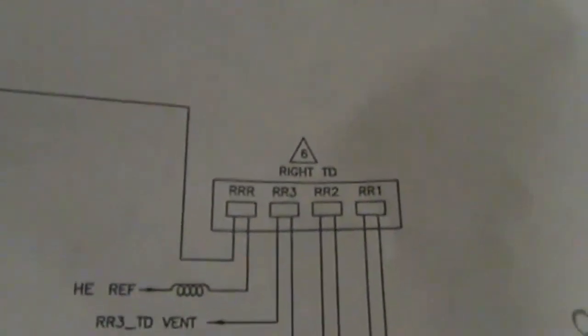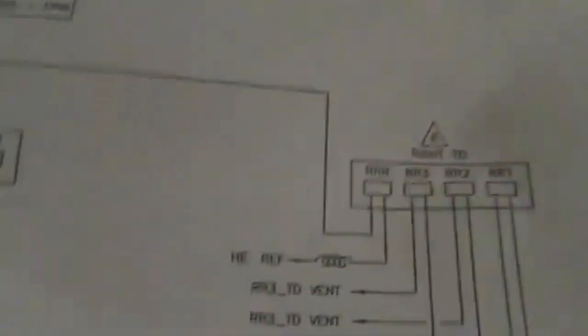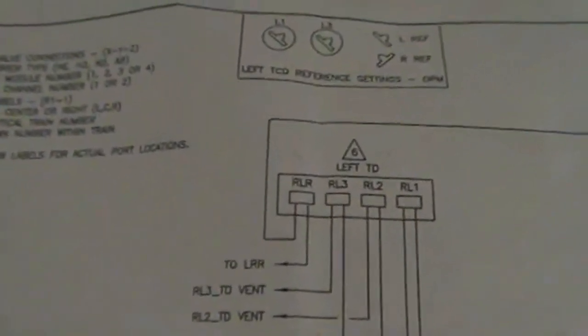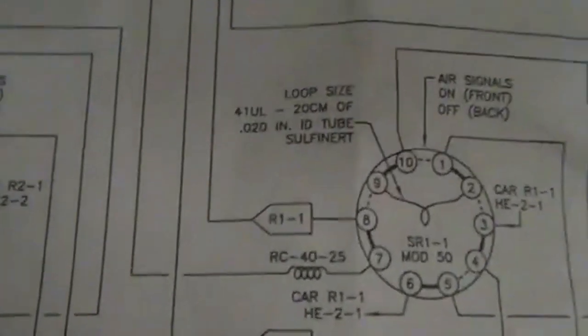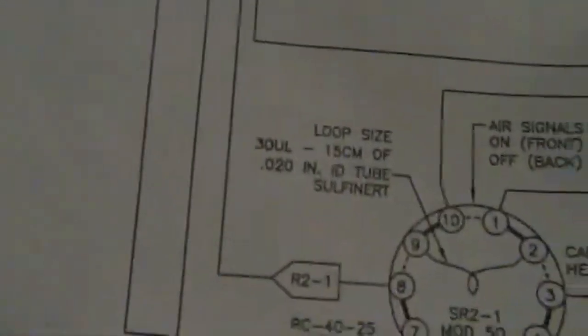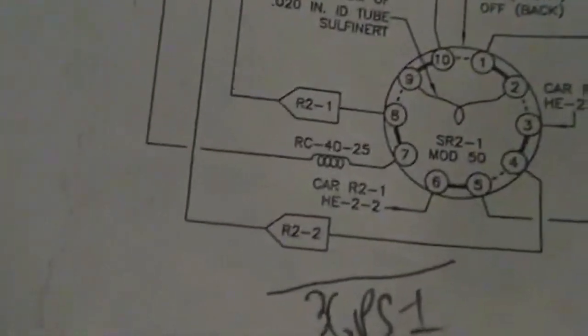Detector 1, pre-cut. 2, main. 3, backflush, reference. See how they tied the references in together? Because the references, all they ever see is carrier gas. So they can tie those in together. Very cool. And then you got your columns. Your pre-cut column, your main column, backflush column.